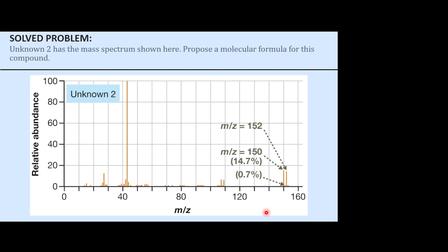Can anybody tell me if you lose this double peak at some point in the spectra? So this one here, does that still have that bromide or chloride? Yeah, pretty obviously, right? Okay, how about these over here? Yeah, not as obvious if you have it or not, isn't it? So you definitely lost it here, didn't you? Definitely no double peak there.